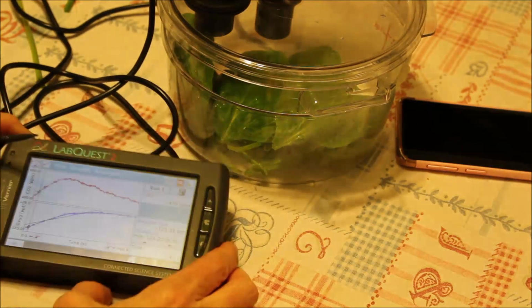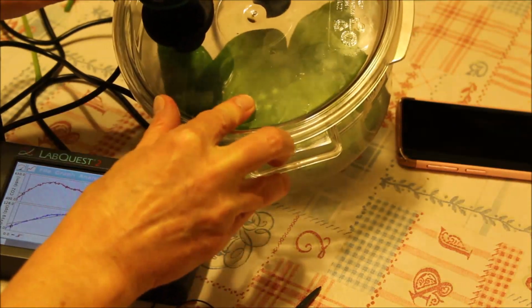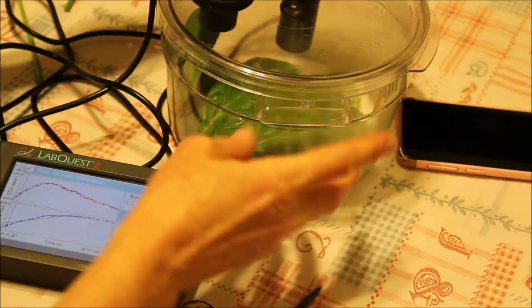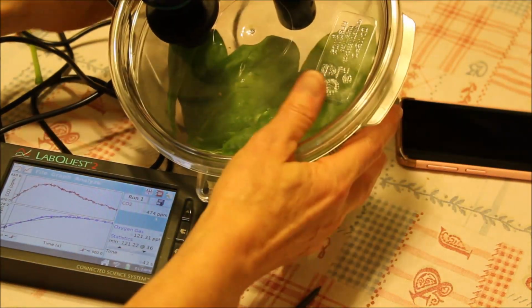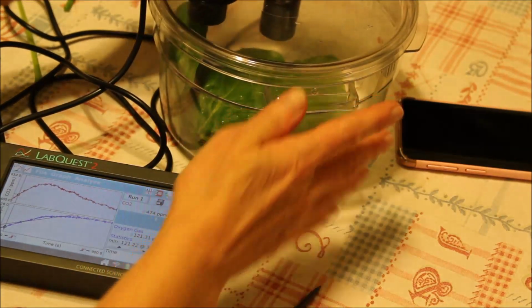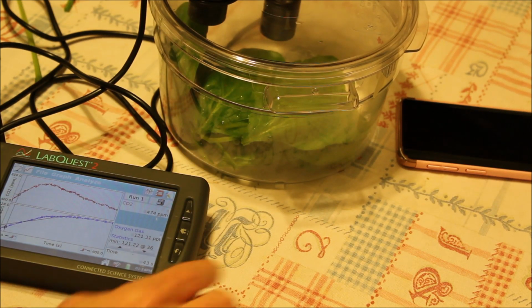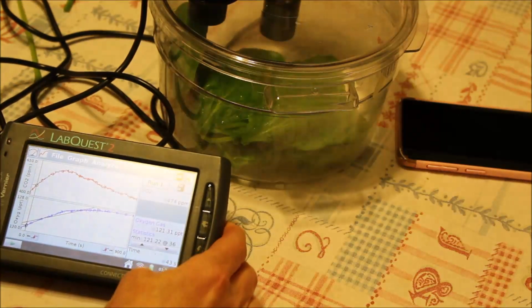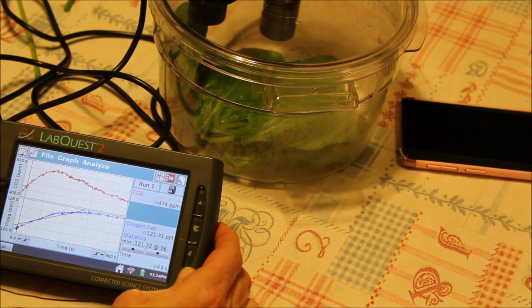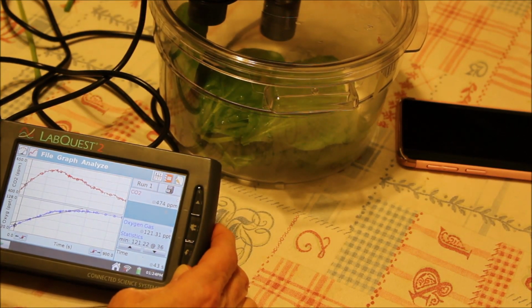This is what I did. I put together the spinach in here with the oxygen sensor and with the carbon dioxide sensor. I put a light around the container, spinach inside, and I used the LabQuest to track the carbon dioxide in the container, as well as the oxygen content in the container.